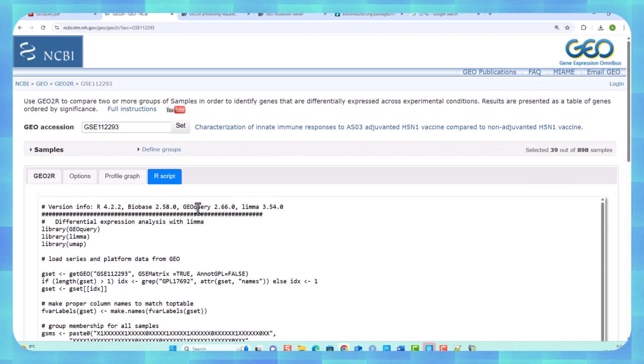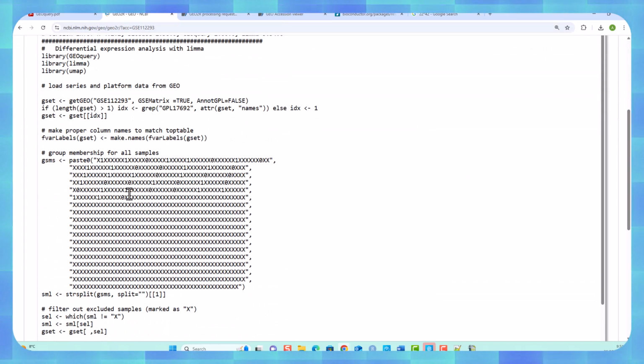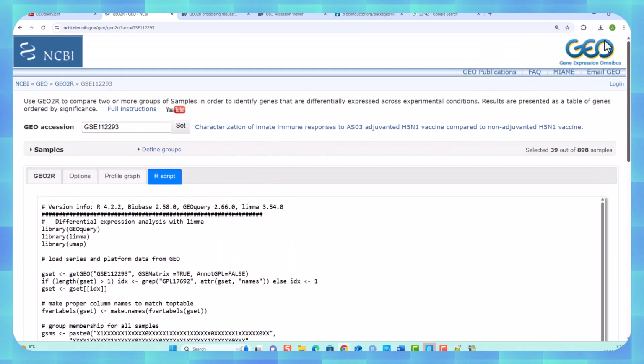So that's sort of nice, though it's still an absolute pig. That's the worst looking system I've ever seen in my life, but at least I get an idea about how that's set up, and I can possibly automate a system to create sets within this data, which will make my life easier. Anyway, I've got that saved for later.